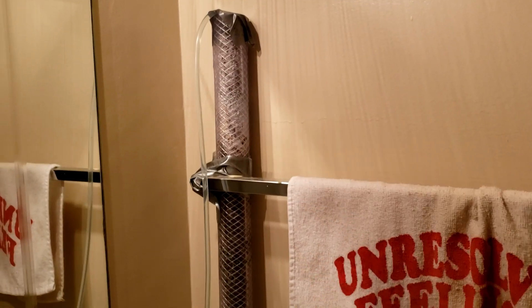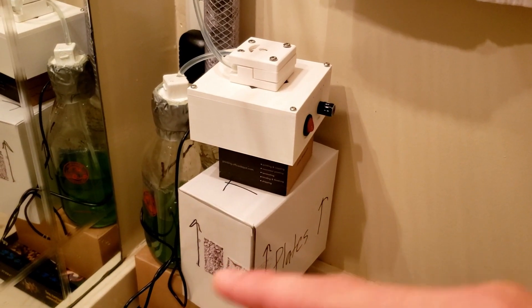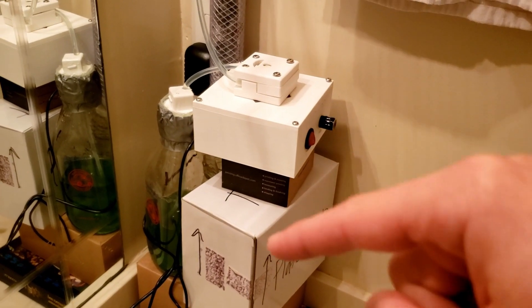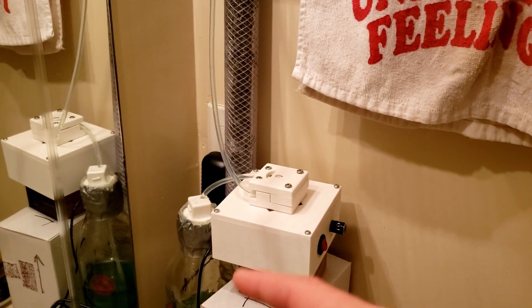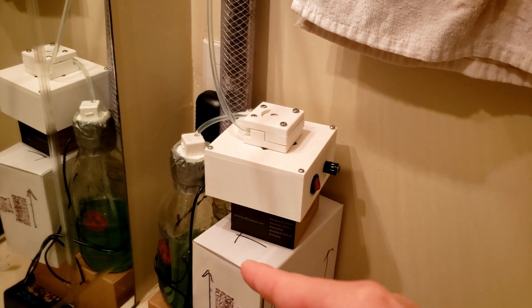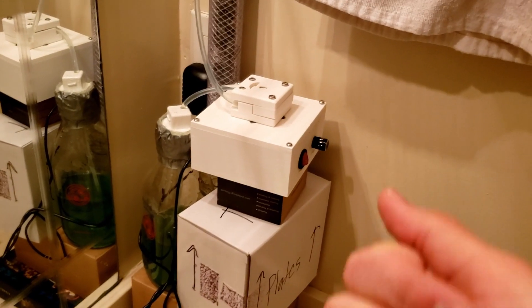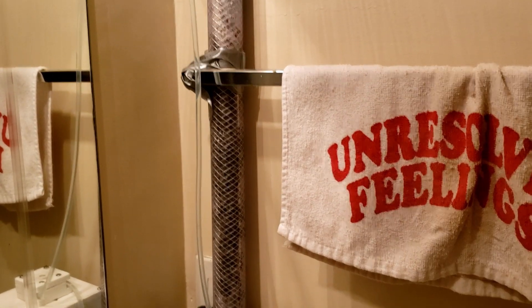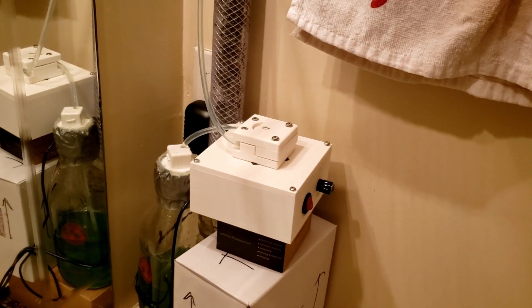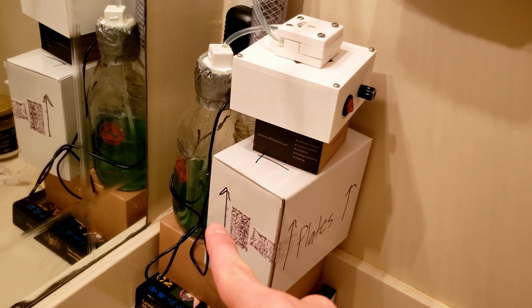Finally, we have a beautiful setup for this tubular flow fungi reactor. I can actually do more experiments later. I'm thinking I really want to try growing penicillium mold in here and see if we get something that can kill bacteria out the other side — a continuous production of penicillin. Penicillin is a little out of date, but the idea of producing a compound continuously is really important to industry. We'll come back when this is all done — hopefully it takes all day.